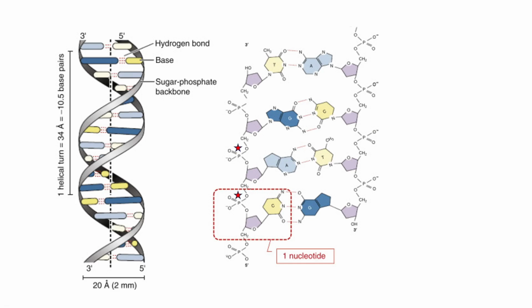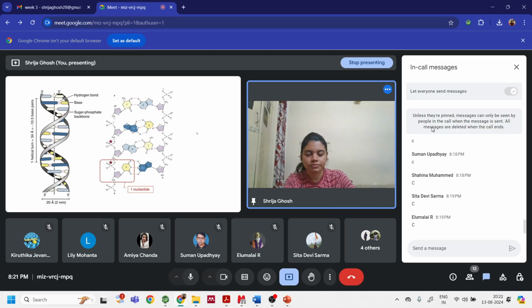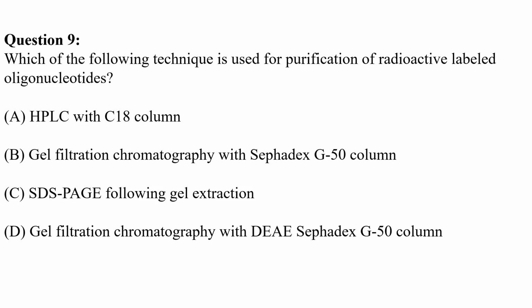Okay, so what do you mean by radiograph? We basically see, based on the radioactivity, because the P32 is radioactive, we can actually image it on a medium. So phosphate is the atom, sorry, that is labeled to visualize the DNA on an autoradiograph. This is clear? Okay.